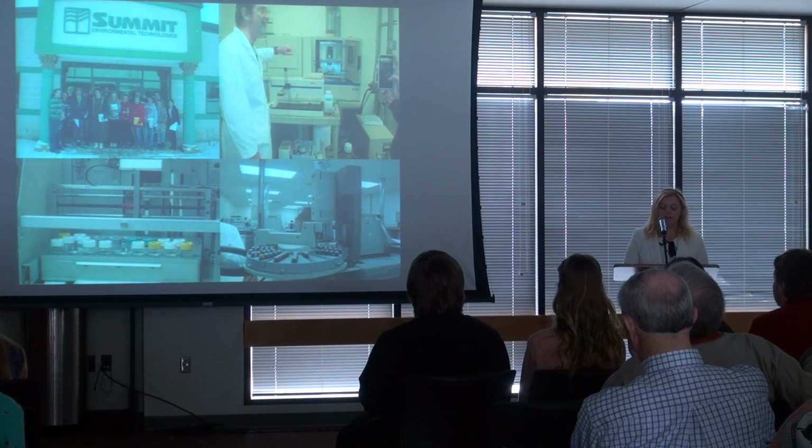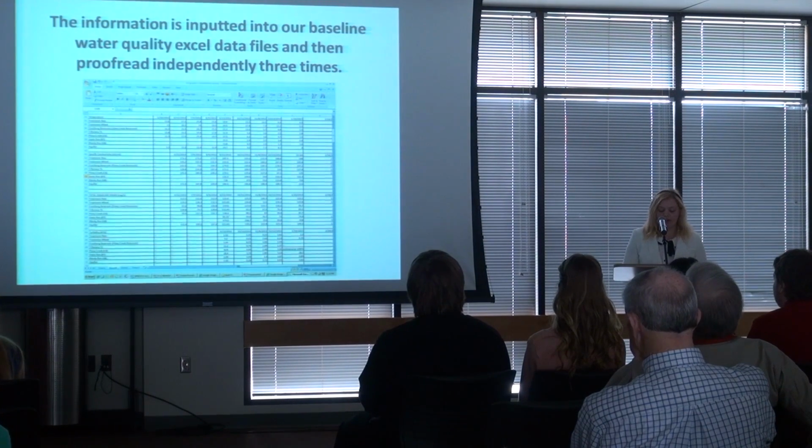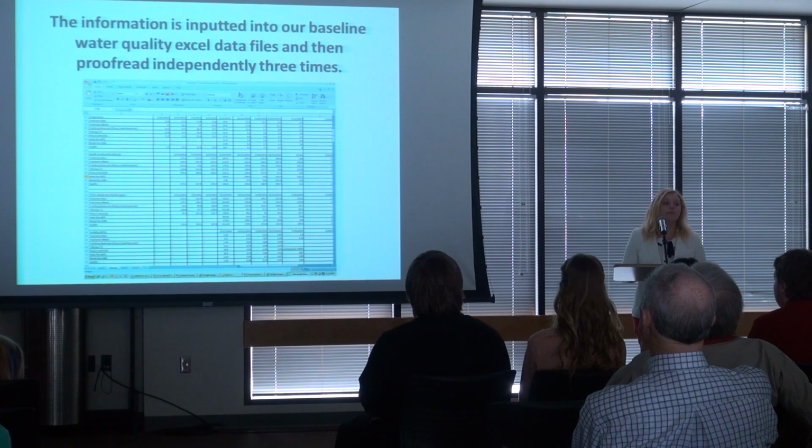The results are first emailed and, once verified, sent as a hard copy to Mountain Ridge High School, where the information is inputted into our baseline water quality Excel data files and then proofread independently 3 times.